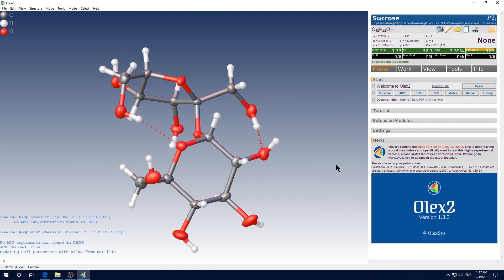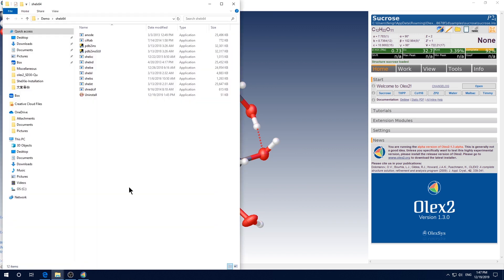Now we need to tell Olex 2 where we installed the ShellXL program bundle. There are two ways to do it. One way is to put the installation path of the ShellXL program in the system path. For that, you can google how to include a program in system path. Today, I want to show you the other way, which I think is much simpler. Just go to the folder of the ShellXL program. Which is the program bundle we just installed.